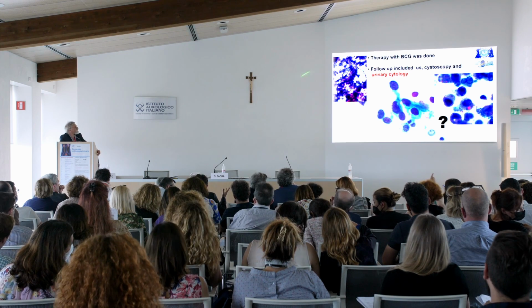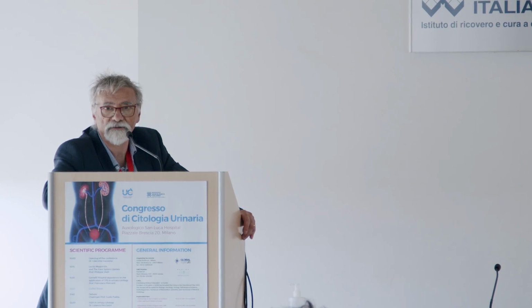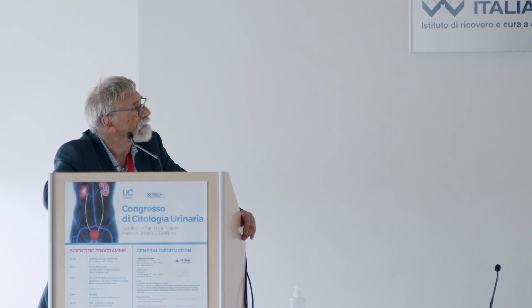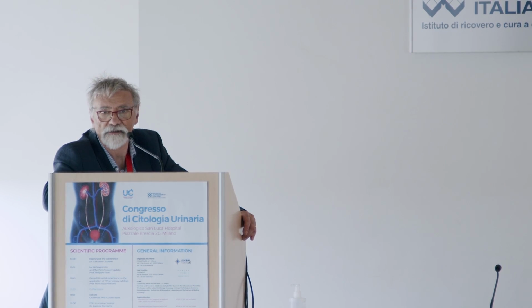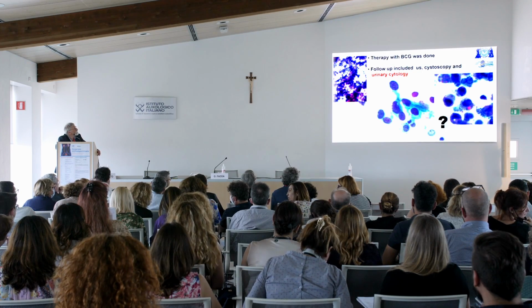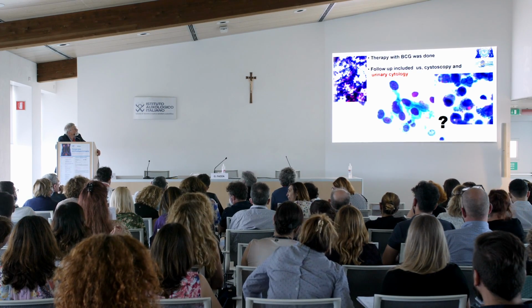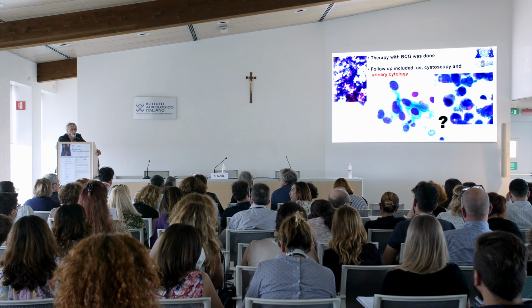Okay, then I'll say. My opinion was reactive changes, of course, in this case, but also in this one. Do you agree? No. Suspicious? Or I will see. Okay. Can I comment?